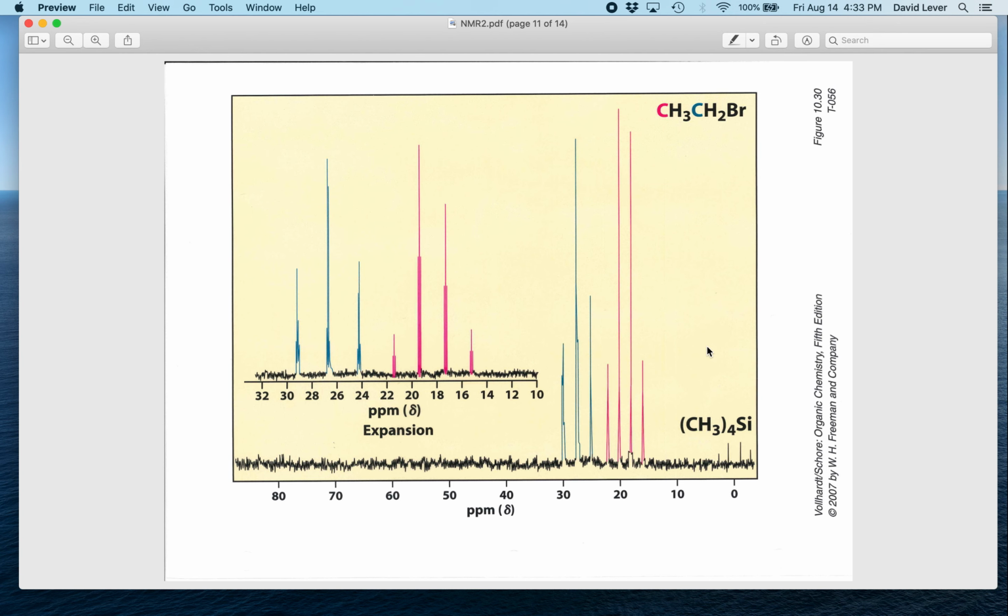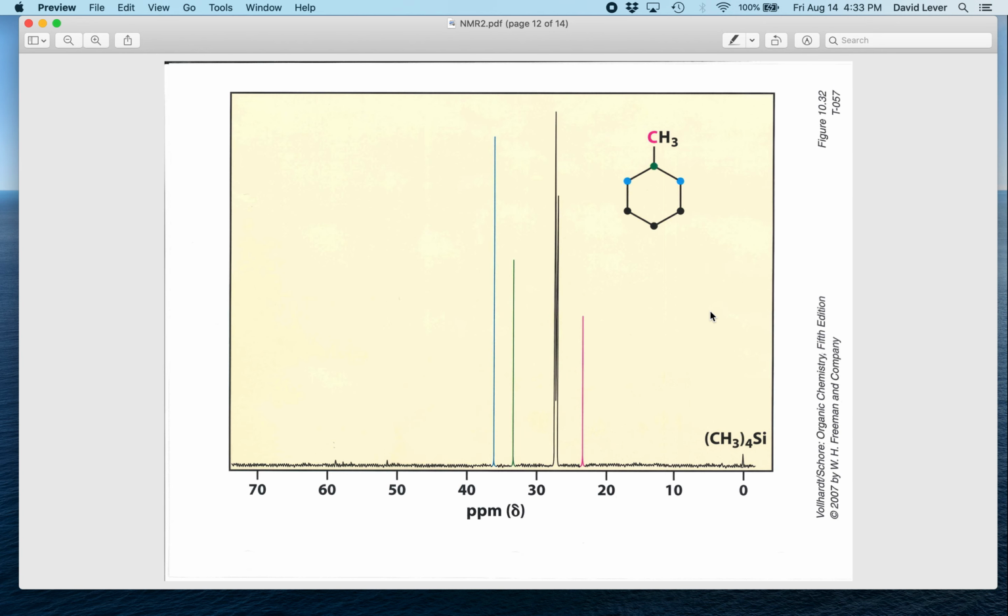a quartet here. So normally what we do is decouple so that all the hydrogens are in the beta state all the time. That's that wideband alternating phase low power technique for zero residual splitting, or WALTZ decoupling. And so the CH3 group is a single carbon, and it's showing up as a singlet. The hydrogens are not splitting it. We've got a tertiary, a CH group, right? So here it is. That's the single hydrogen.